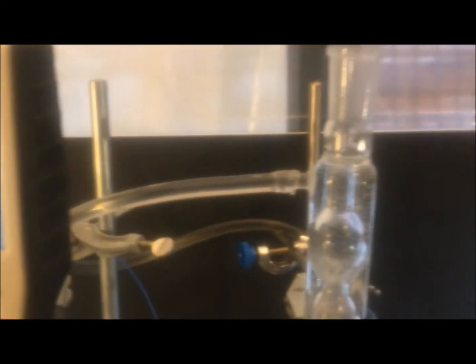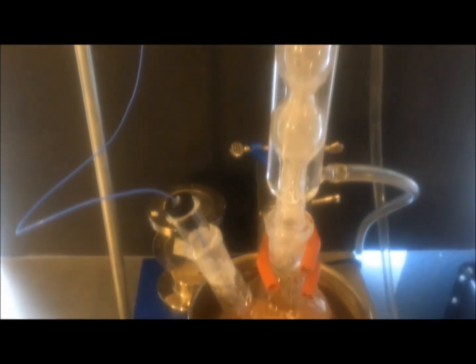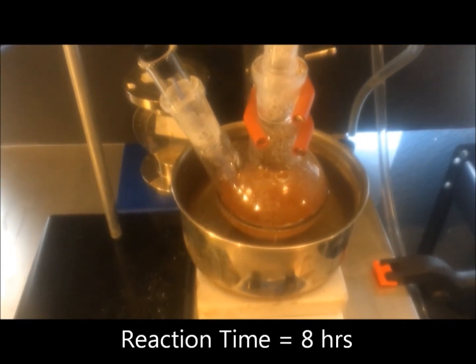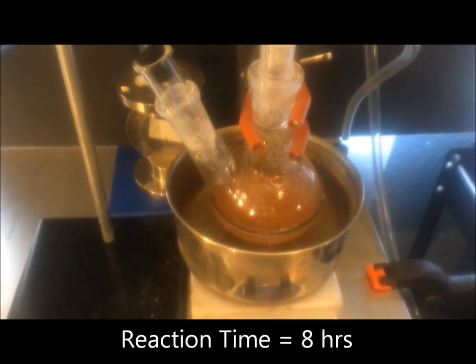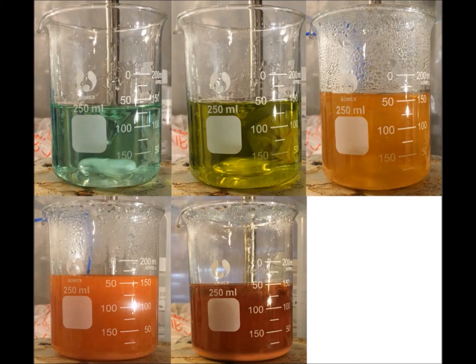Now, while some of the reactions I researched occur instantaneously, unfortunately this is not one of them. It needs to be held at 80 degrees C for 8 hours with constant stirring. The reaction mixture undergoes a color change during that time, starting out as a light blue and progressing toward a brick red, which gets darker and darker toward the end. It's also a good time for you to catch up on all those things you've been procrastinating on around the house.